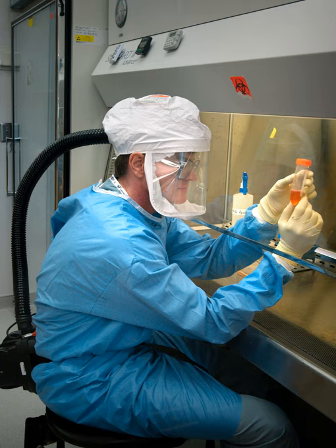Topic: Work practices. As with work on open bench tops, work performed within a BSC must be performed carefully and safely. To avoid contamination and the risk of personnel exposure, the CDC advises investigators to follow best practices to reduce and control splatter and aerosol generation, such as keeping clean materials at least 12 inches (30 centimeters) from aerosol-generating activities and arranging the workflow from clean to contaminated.